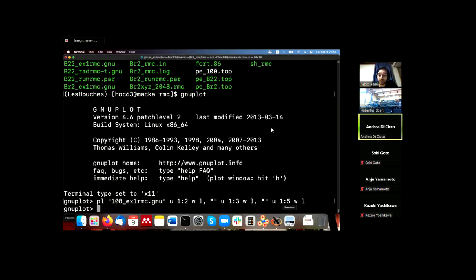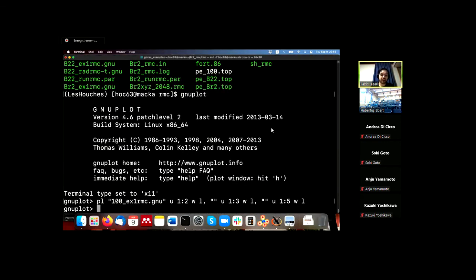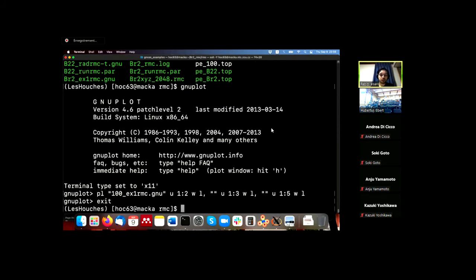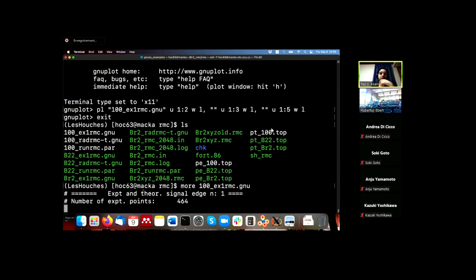It's a very good fit. Okay. So this is for the GNXAS, and then there are other output files. Let me show you first this GNXAS file, what it contains.